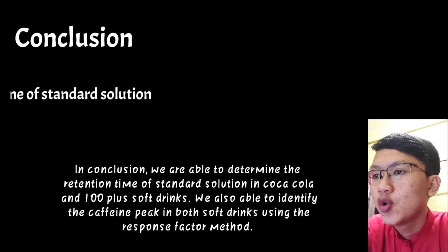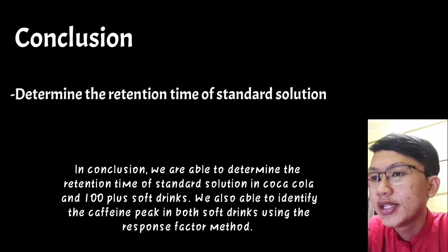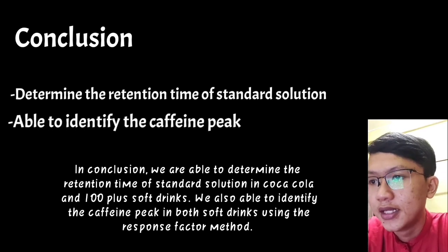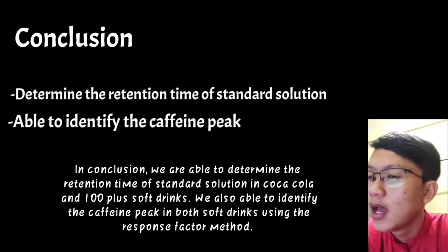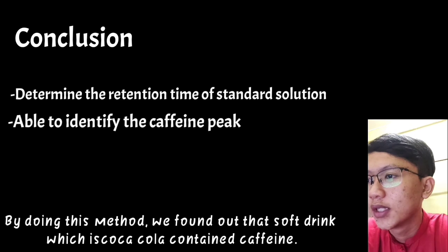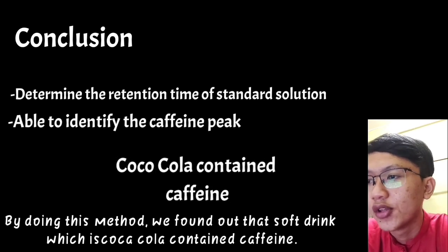In conclusion, we are able to determine the retention time of standard solution in Coca-Cola and 100 Plus soft drinks. We are also able to identify the caffeine peak in both soft drinks using the response factor method. By doing this method, we found out that the soft drink, which is Coca-Cola, contains caffeine.